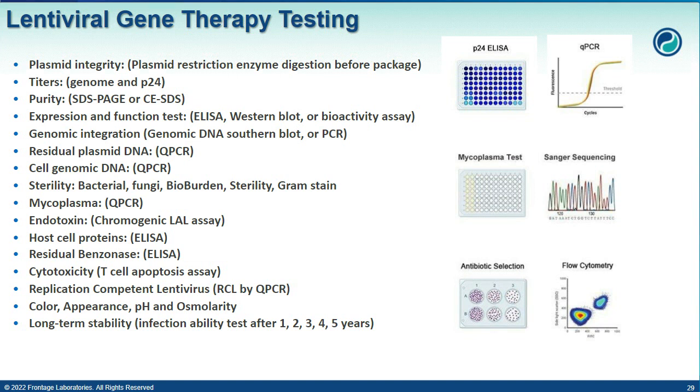Like mentioned, the replication competent lentivirus, RCL by Q-PCR, and the long-term stability program, which includes the infectious ability test and the color, appearance, pH, osmolality at different time points.